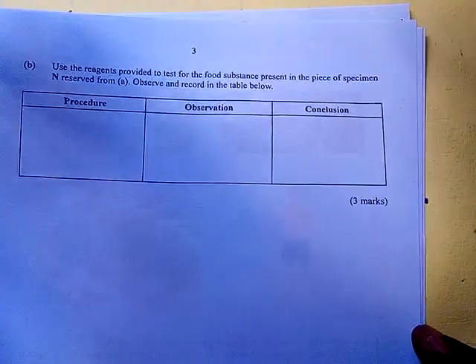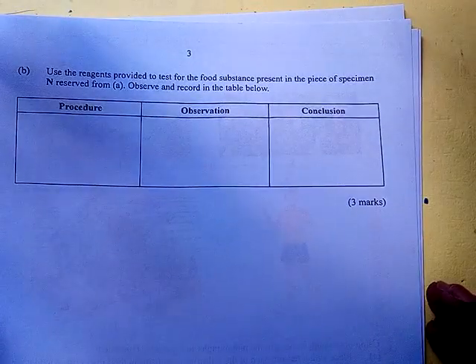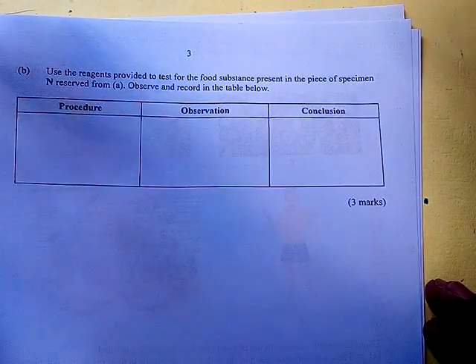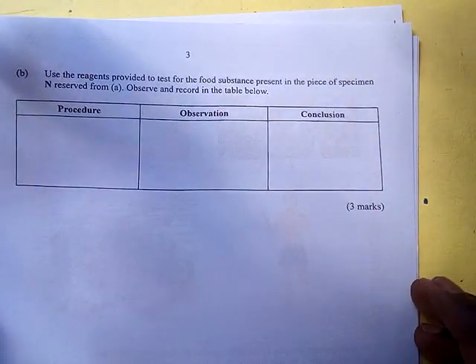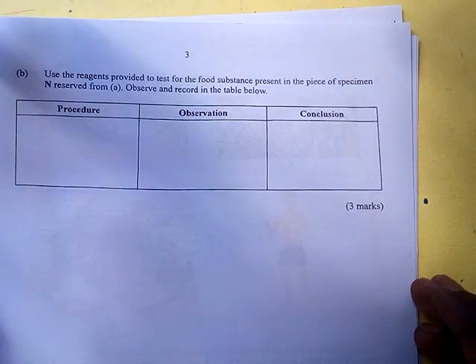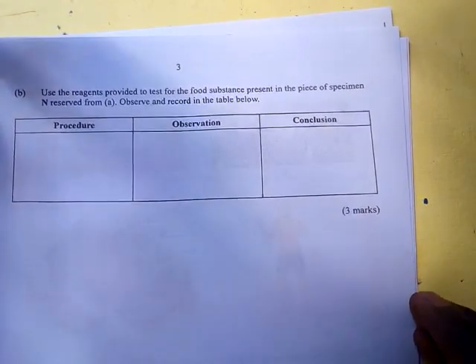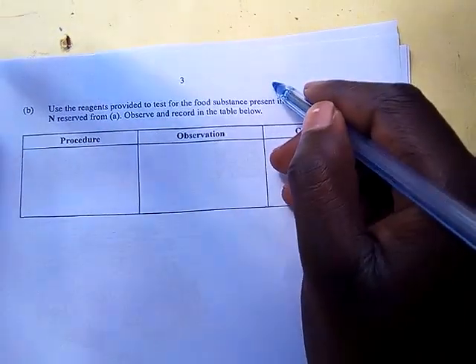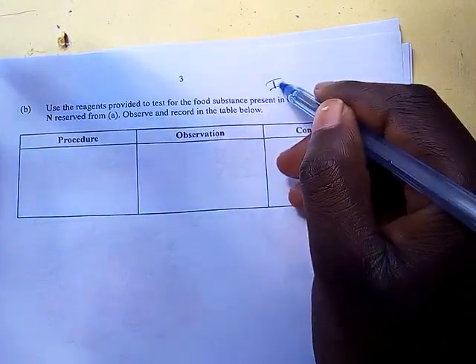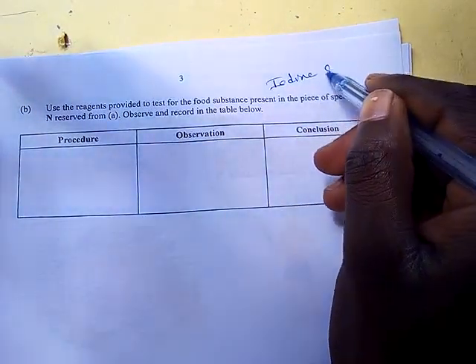In B, you are told to use the reagent provided to test for the food substance present in specimen N from A. Observe and record observation in the table. And in this paper, they provided iodine solution.